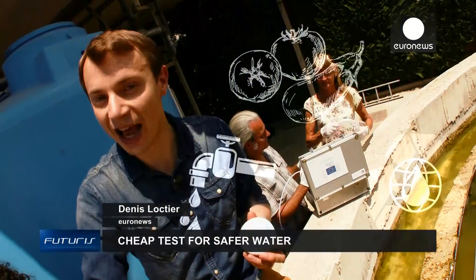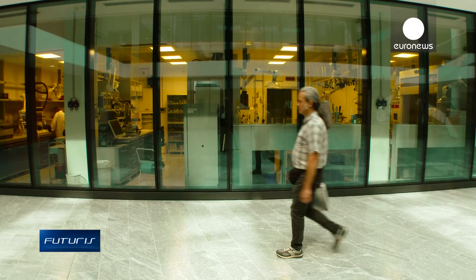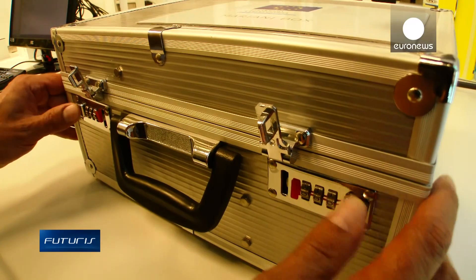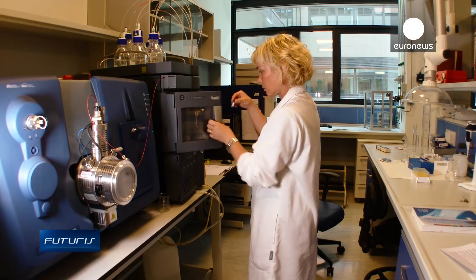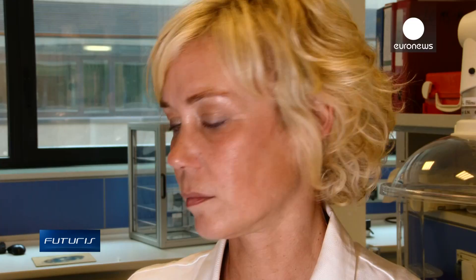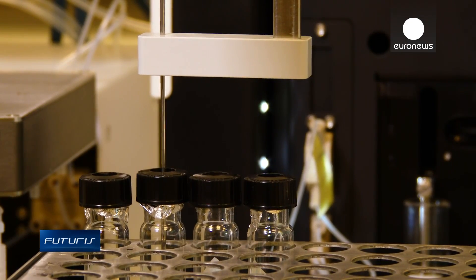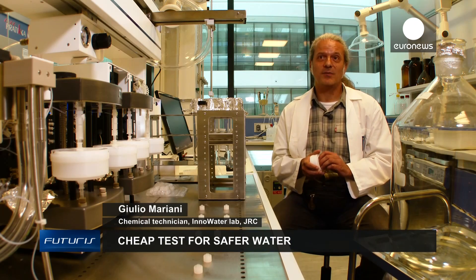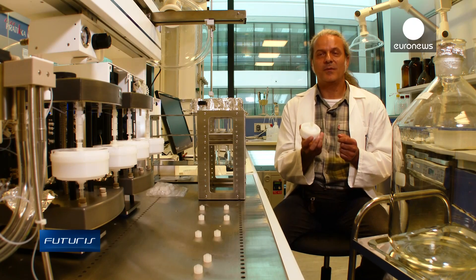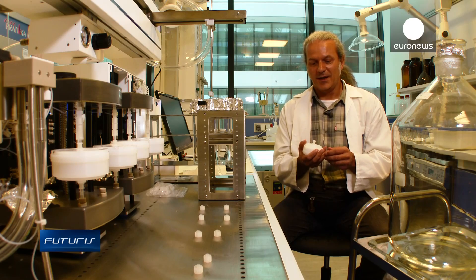So now we have the sample — what's next? The filters are much easier to deliver to the lab than heavy, fragile glass bottles. Sometimes dozens of litres of sample water are needed to check for various chemicals. The advantages of using this filter compared to traditional analysis techniques are that trapping many organic compounds on a single filter simplifies the analysis, reducing the costs and time, and improving sample preservation.